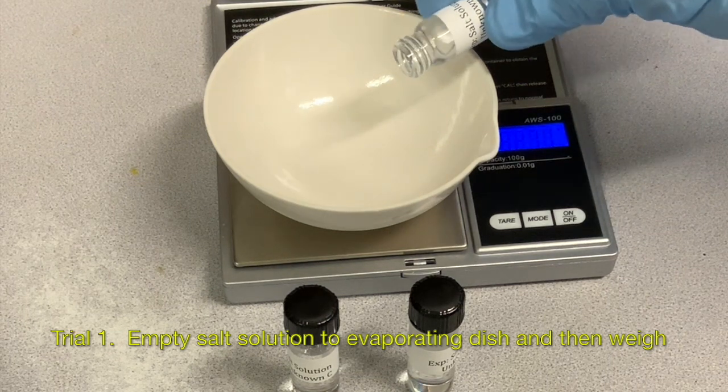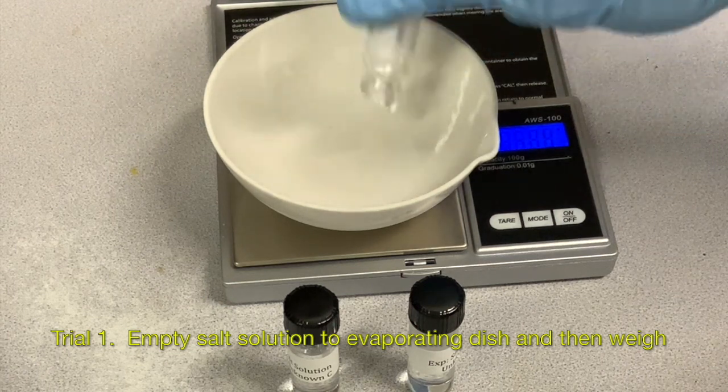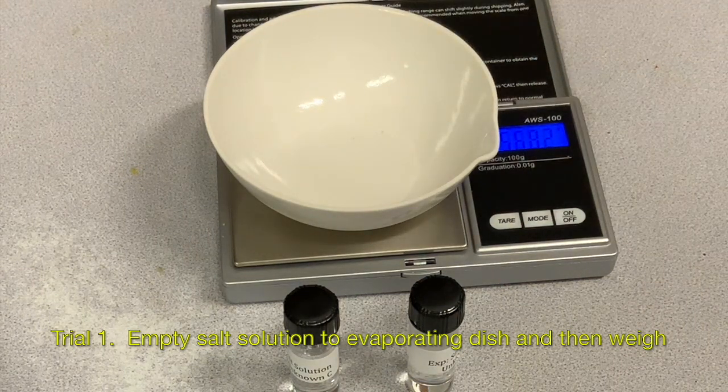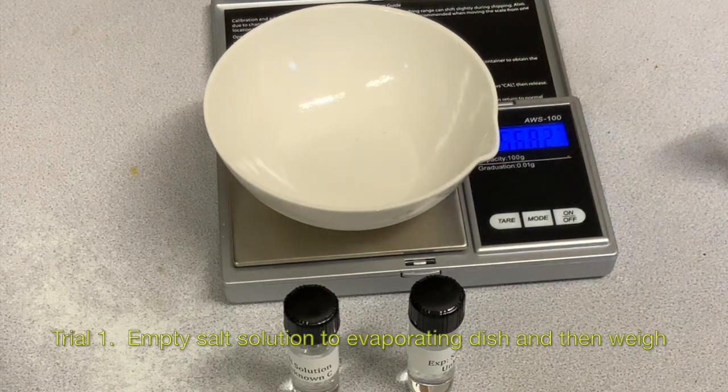When I add this, you want to add all the content, and make sure your evaporating dish is clean. I'm going to record the new mass with the solution, in this particular case 56.82 grams. The difference will be the mass of the solution.